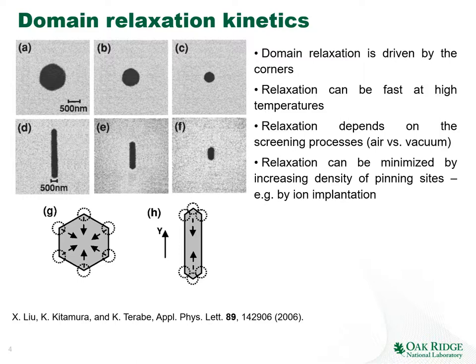So this is the beautiful example of work coming from Professor Kitamura, when they created the domains in lithium niobate. So you can see the hexagonal domain or the elongated domain. And they observed this domain dynamics over time. And you can notice that the hexagonal domain starts to shrink while generally maintaining the sort of roundish hexagonal shape, whereas the elongated domain shrinks only in this direction.